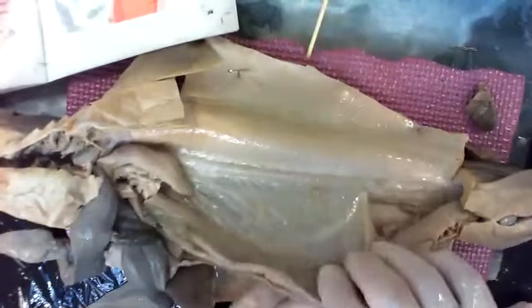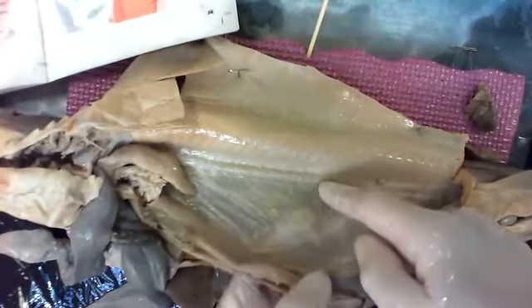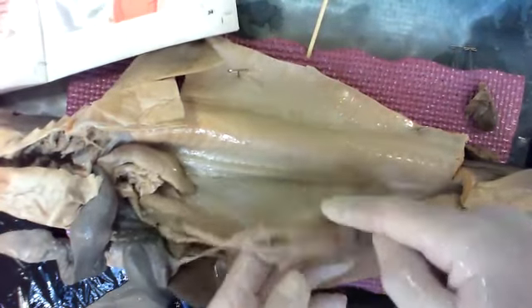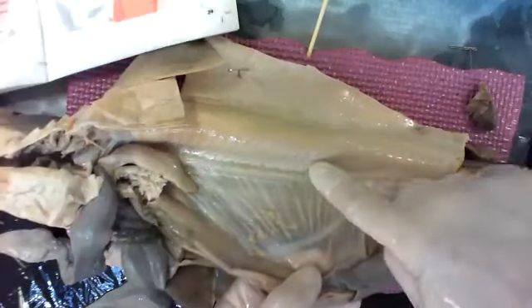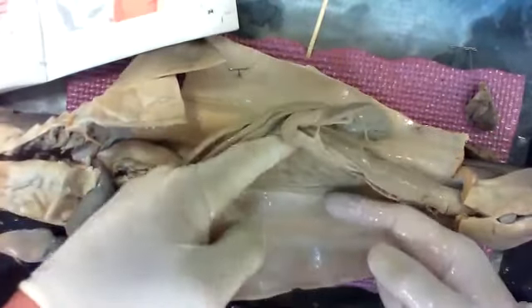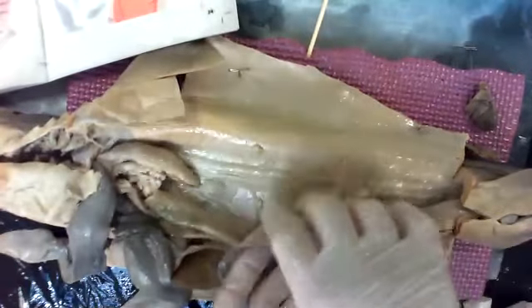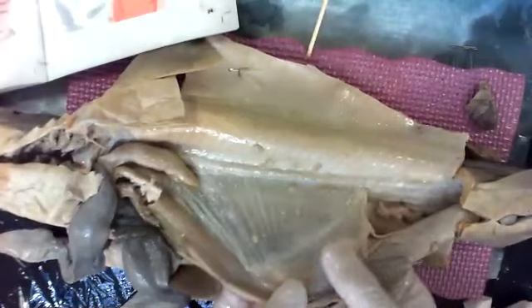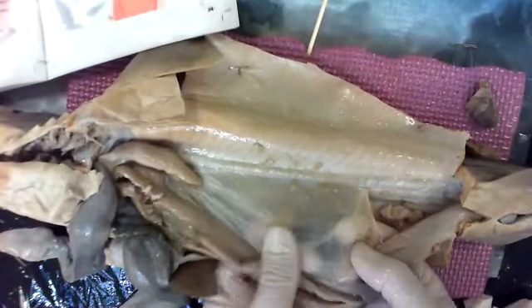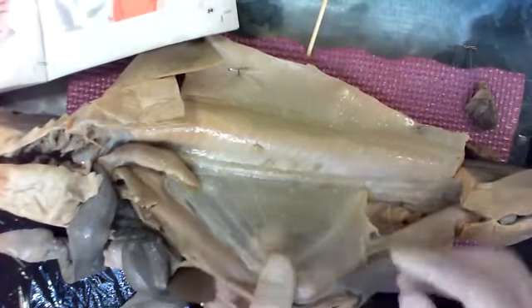If you move everything out of the way, do you see the sac? This sac connects to the vertebra, comes all the way up. It wraps around the internal organs, right? Goes down, wraps around the inside of the body, comes back around, goes back and wraps around the internal organs again. They're all protected by a sac. This is called the peritoneum. There you see, looks like a blood vessel. Yes, part of a blood vessel going through here.